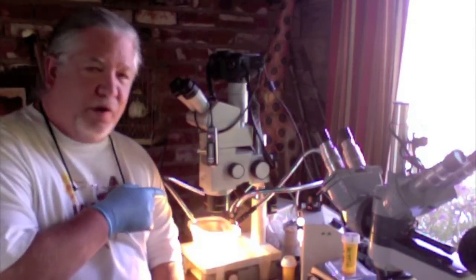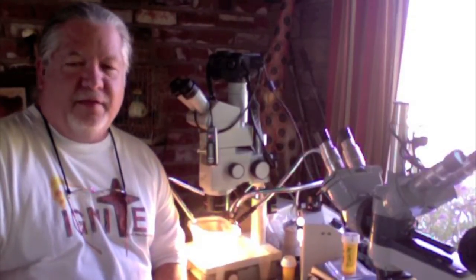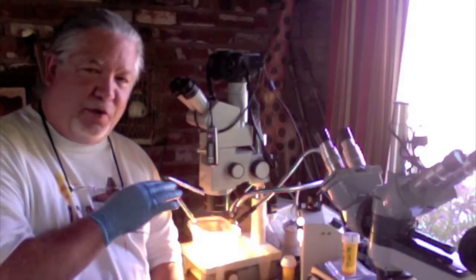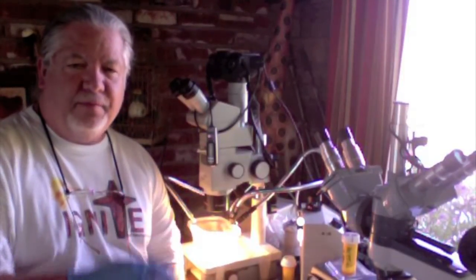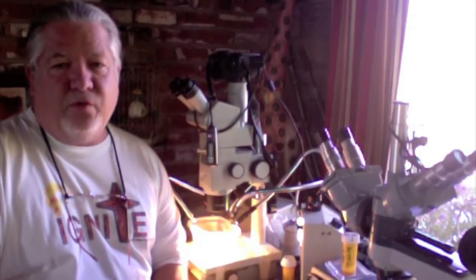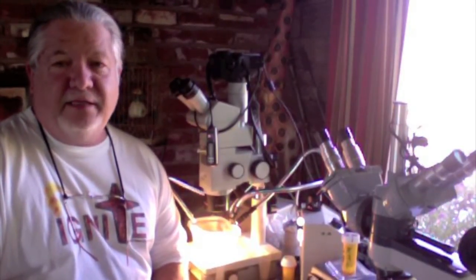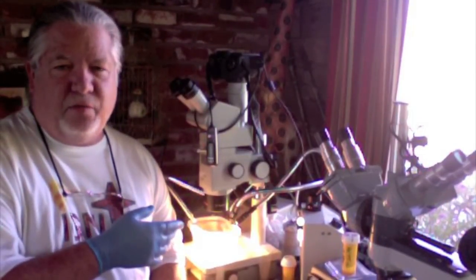I'm looking at something very exciting. I'm looking at dinosaur bone in my dissecting microscope. This is bone that I have put through what's called a decalcification process, and I'm actually seeing the soft tissues left over after the bone mineral has been decalcified or taken away. This is very exciting because dinosaurs are supposed to have lived and died some 65 million years ago, and yet we still find soft tissues in their bones.